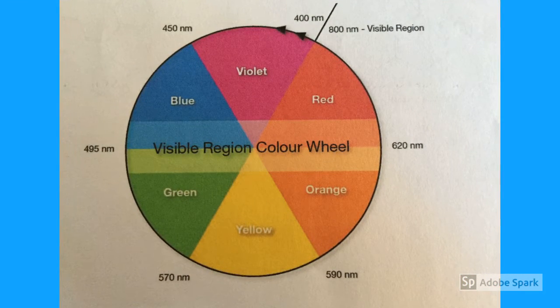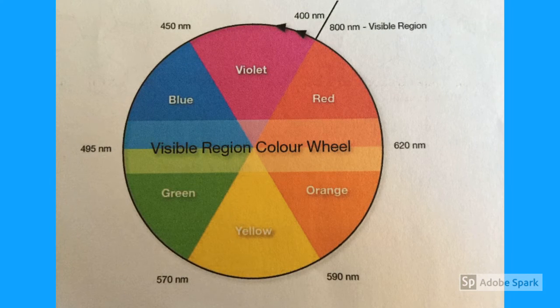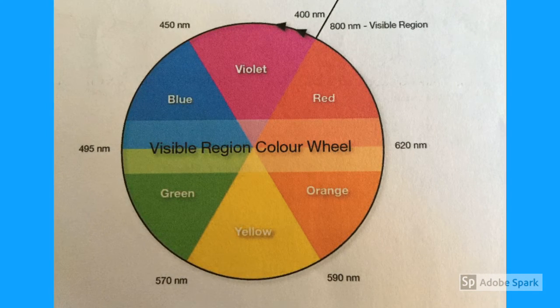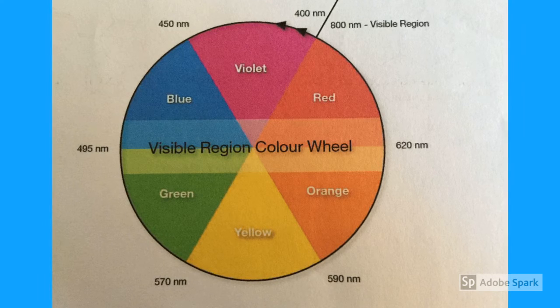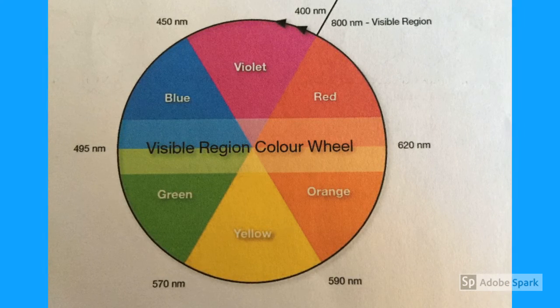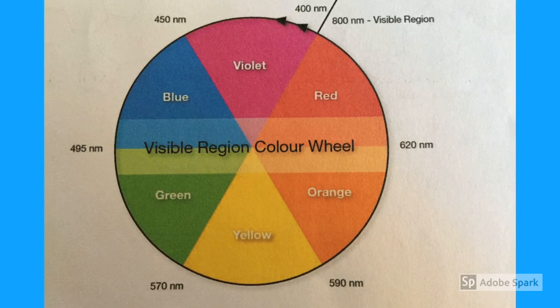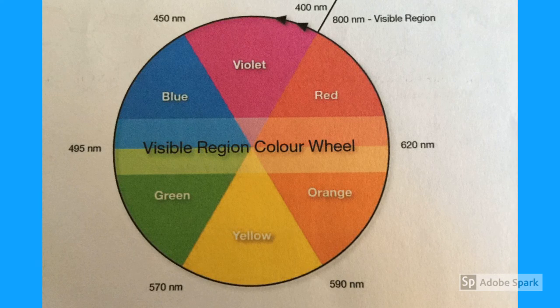616 nanometers falls slightly inside the range of orange light, but very close to red. If lambda max determined the observed color, then the color would have been a very red orange, but the mixture appeared as a neon orange to us. Therefore, observed color does not determine lambda max, because if it did, lambda max would have been closer to the yellow wavelength at about 590 to 600 nanometers.